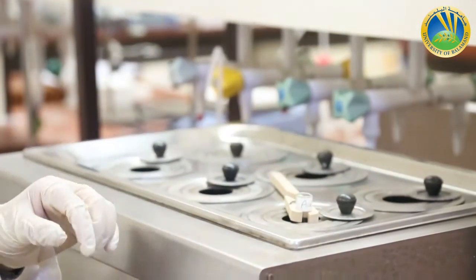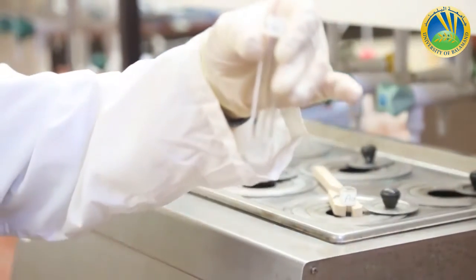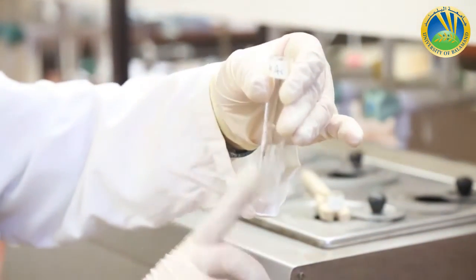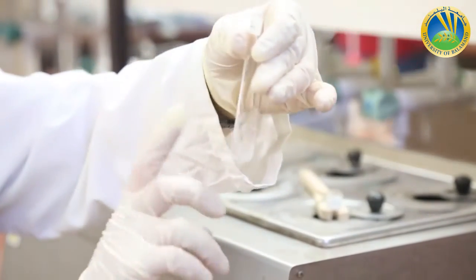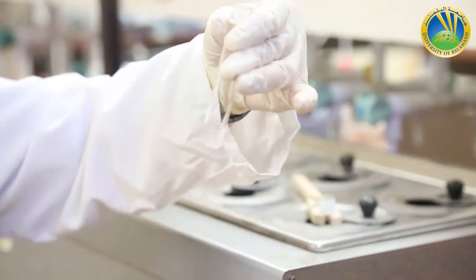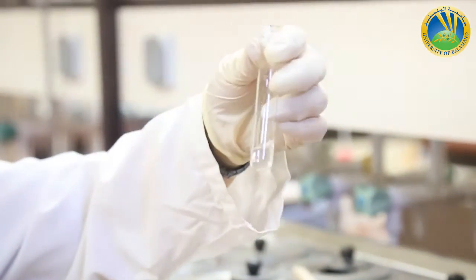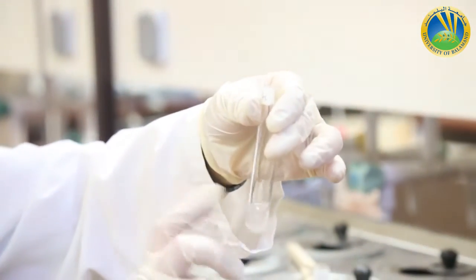I can do the benzoic acid test at cold. The benzoic acid is still at the bottom of the tube at cold.